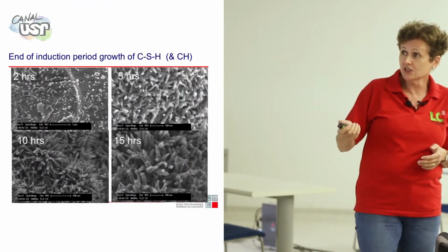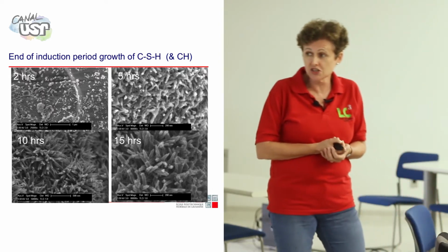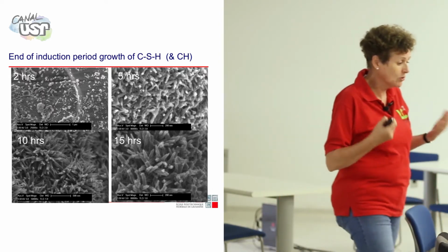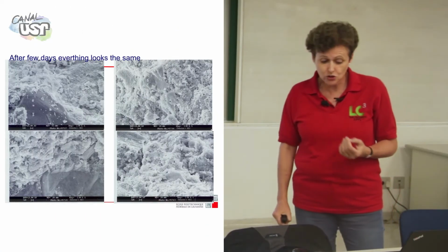We can see the CSH, and as we go on, we can see very nicely how this CSH is developing on the surface and then grows through this main heat hydration peak. And this can help us to put together kinetic models of the hydration. So that's some examples of how I think it's useful, but I would say it's really generally not useful after about 1 day.